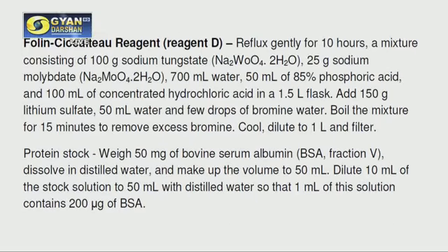And as we have mentioned, the Folin-Ciocalteu reagent, that is reagent D, contains sodium tungstate, sodium molybdate, phosphoric acid, and concentrated hydrochloric acid. So the reactions are given here. When you prepare the solution, you can prepare it in this fashion. And of course the protein stock.